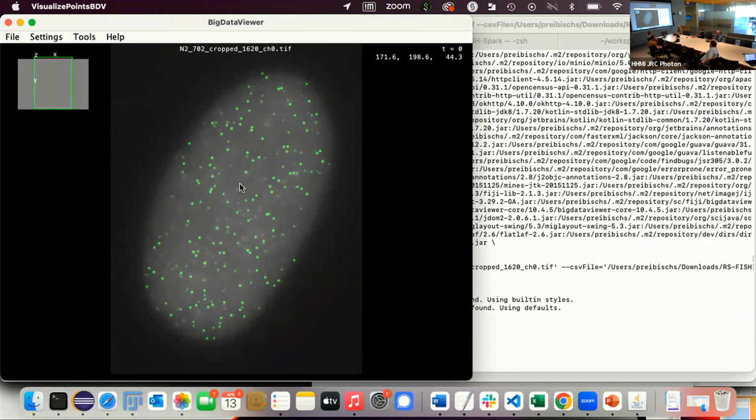Are you still having problems with the Float? Yeah, I don't have it installed. But it's okay. It's pretty annoying that it always pops up even if I don't load the Float data. I keep meaning to talk to Stephan about it at some point.